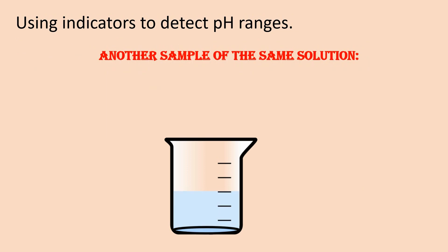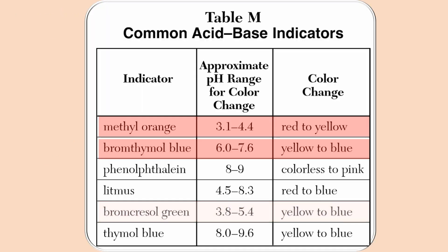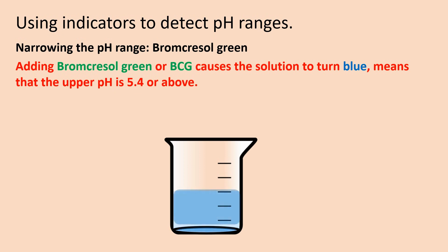Now for another sample of the same solution. As previously determined, the pH range of the original solution was 4.4 to 6.0. Now let's narrow the pH range using a different indicator, bromcresol green. Bromcresol green has a pH range from 3.8 to 5.4, going from the colors yellow to blue. This means that at a pH of 3.8 and below, the solution will be yellow, and at a pH of 5.4 and above, the solution will be blue. Adding bromcresol green or BCG causes the solution to turn blue, which means that the pH is 5.4 or above.